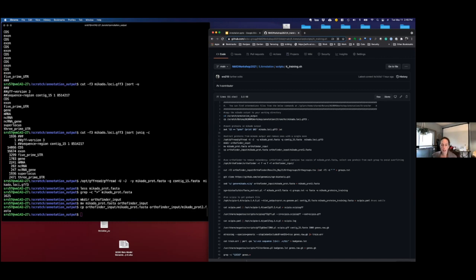You don't want a lot of single exon genes, because then you're not going to be training the intron exon boundaries. So will this be matching the genes basically with themselves? Yep. It's all still internal, but you're just asking which ones are likely to be in the same family. Yeah, it's making gene families with itself, and it doesn't let you do it with one file, which kind of makes sense, because ordinarily you'd be looking at different species. So it's just sort of fudging it. Yeah, so that's why we do that.